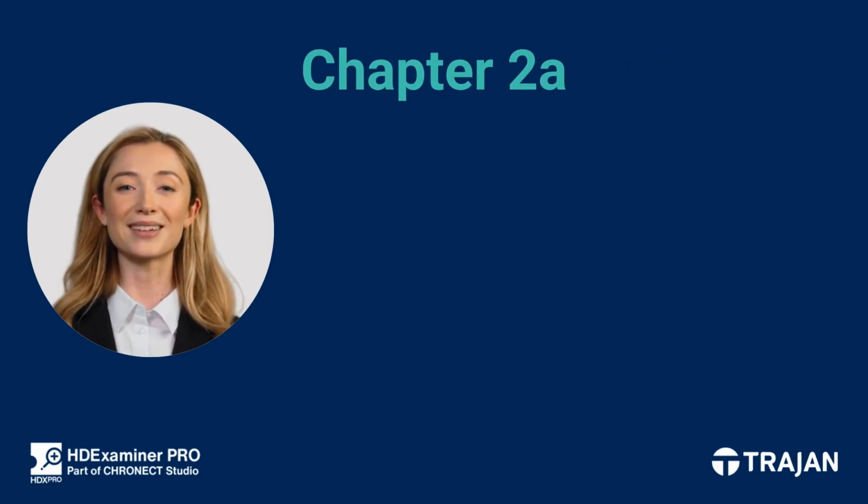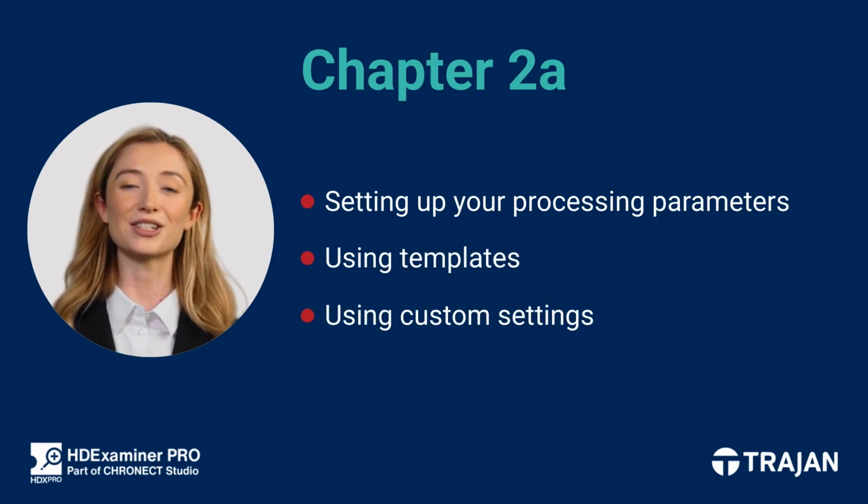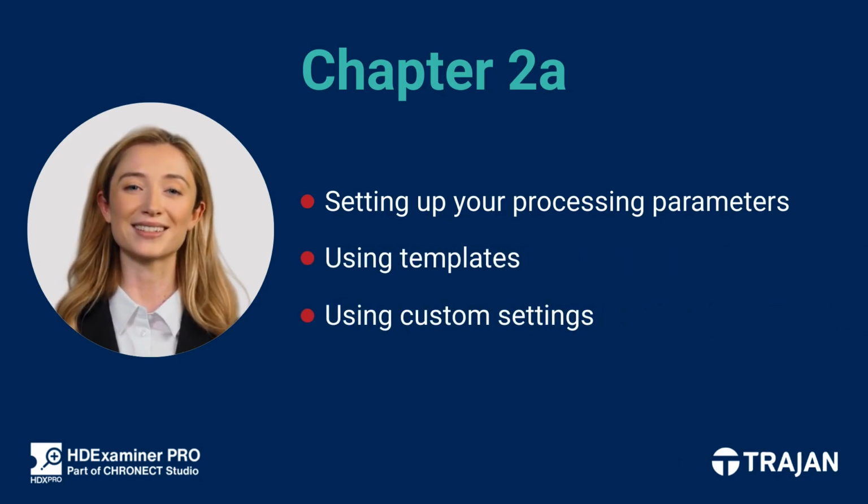Welcome to Chapter 2A. In this segment, we'll walk through how to set up your processing parameters using templates and custom settings, so your HDX data is ready for analysis. Let's begin.